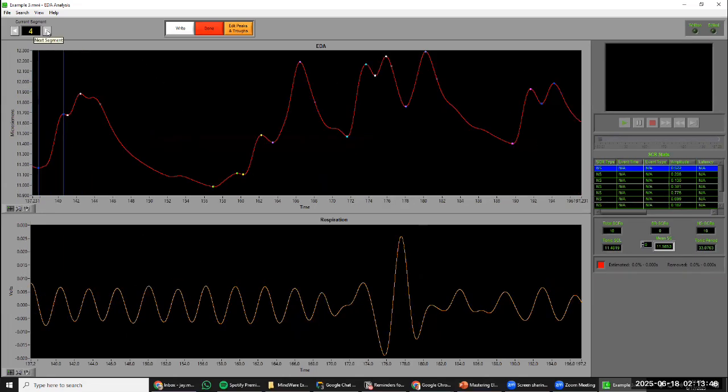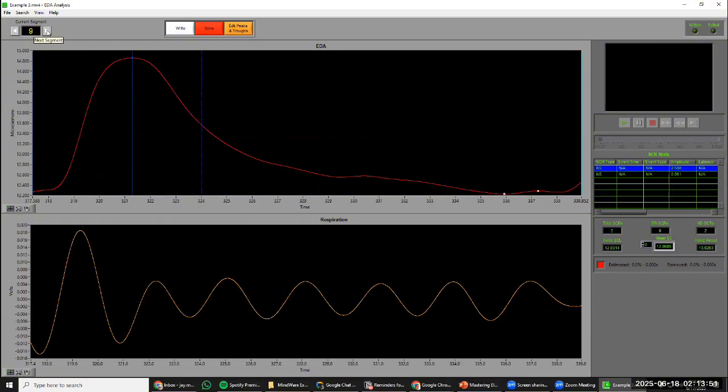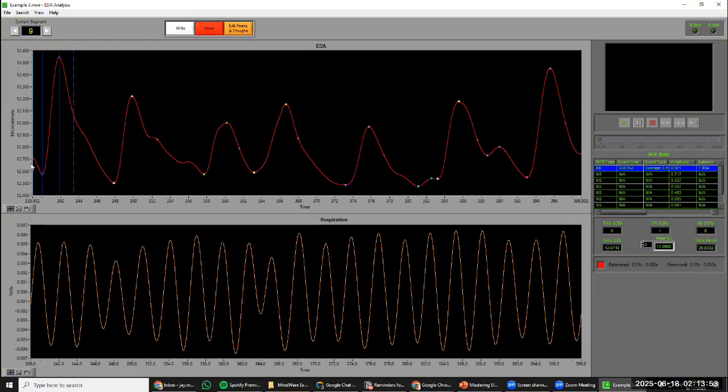But as we go through here, we can see if any of these will line up within that window. And here we go. Here's an actual event that occurs. Then a little bit more than a second later, we see this change. And so now this specific one here that you can see is being identified as an event-related response. So that is how that component works.